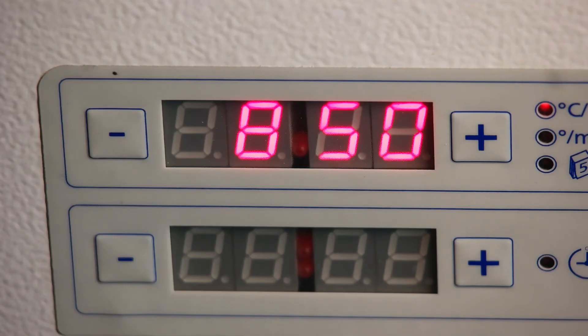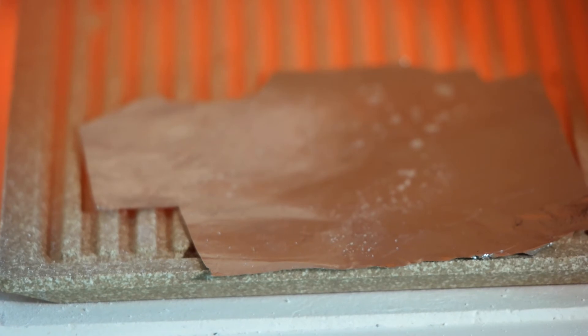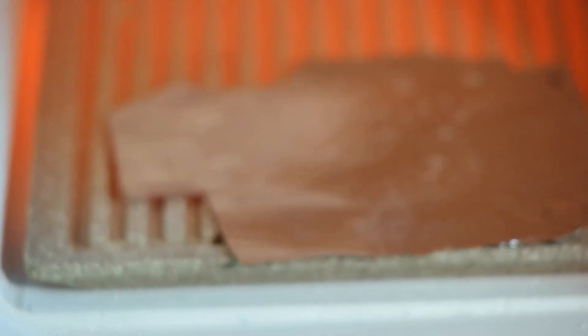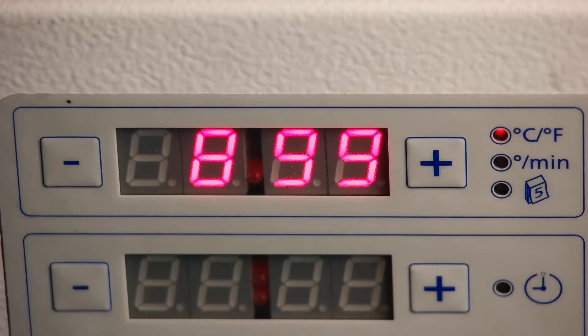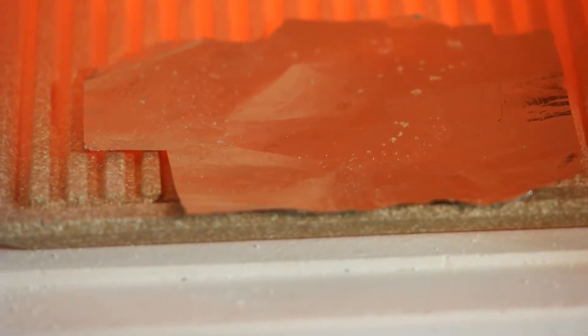At around 850 degrees it's already glowing nicely. Maybe on the left-hand side the residue got a little bit smaller but I'm not quite sure. Let's pull it to the front — hard to say, I guess it's already less than it was before. It's cleaning up slightly — as you can see it's getting smaller.